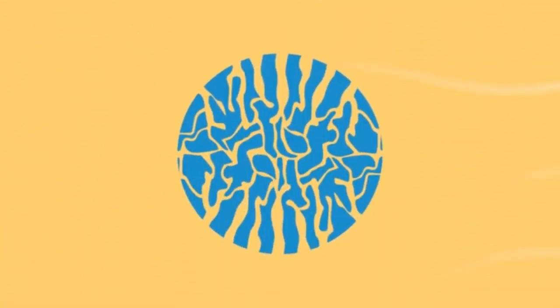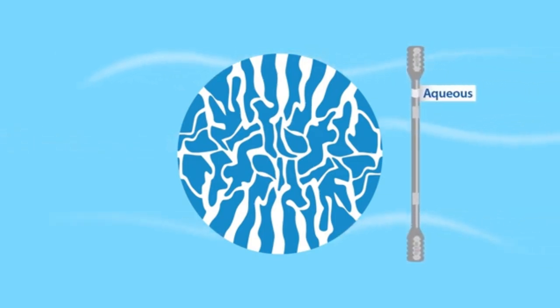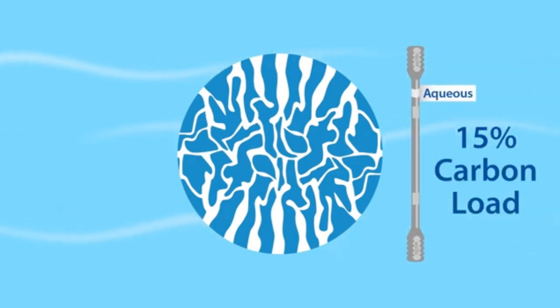But what if your mobile phase contains a high percentage of water or your analytes are more polar? Under highly aqueous conditions, a traditional C18 column will undergo a phenomenon known as phase de-wetting. When this occurs, the hydrophobic C18 chains repel water out of the particle pores, which limits analyte access to the stationary phase. So in this case, an aqueous C18 column, which has about 15% carbon load, is recommended.